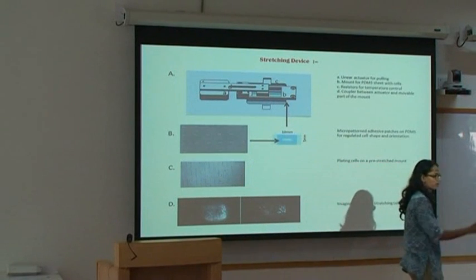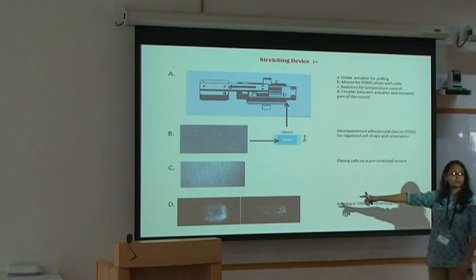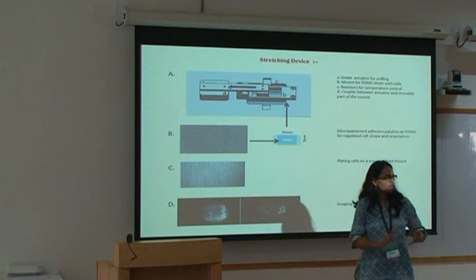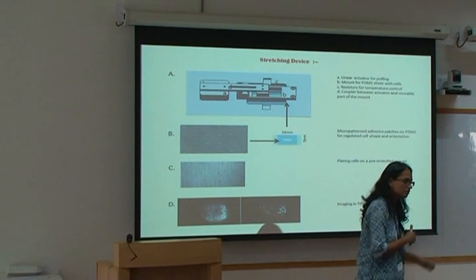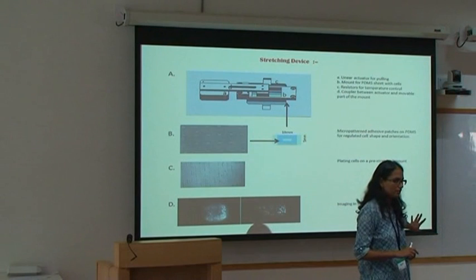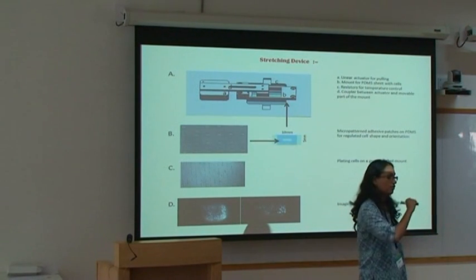And these are images where caveolin 1 GFP is expressed by the cell. They form small 50 to 200 nanometer dotted structures, not claiming that each of them is that size, they can be clusters. But you can sort of start resolving it. It's not something that you can do with glass in 100, 300 milliseconds. You can take 300 milliseconds in the same kind of camera and have an image like this. With PDMS, you might have to do a 3-second averaging.